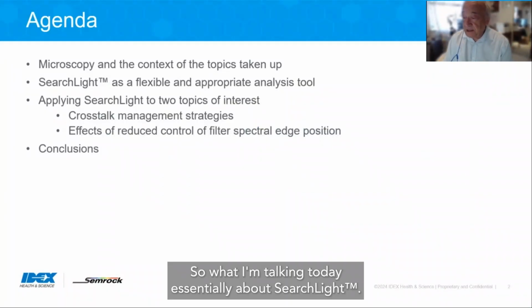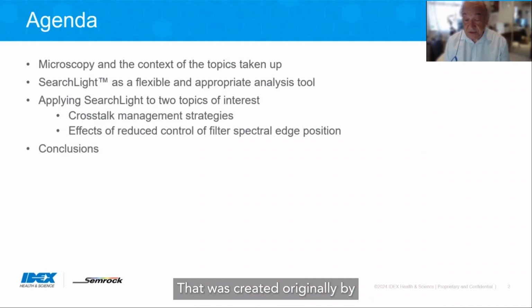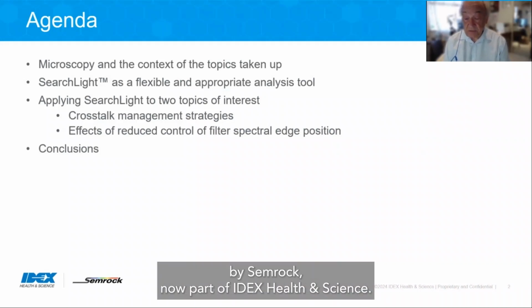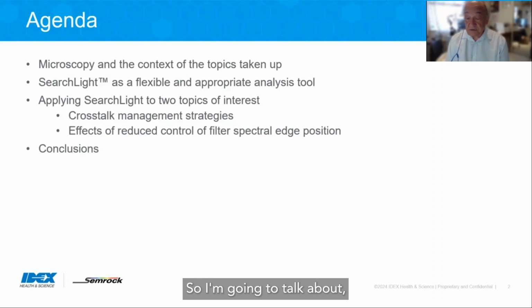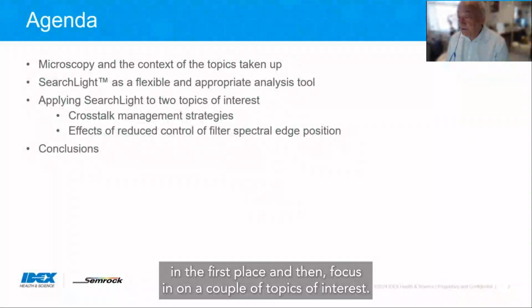So I'm talking today essentially about SearchLight. This is a modeling tool for use in fluorescent microscopy that was created originally by Semrock, now part of IDEX Health and Sciences. So I'm going to talk about something basic about SearchLight in the first place, and then focus in on a couple of topics of interest.